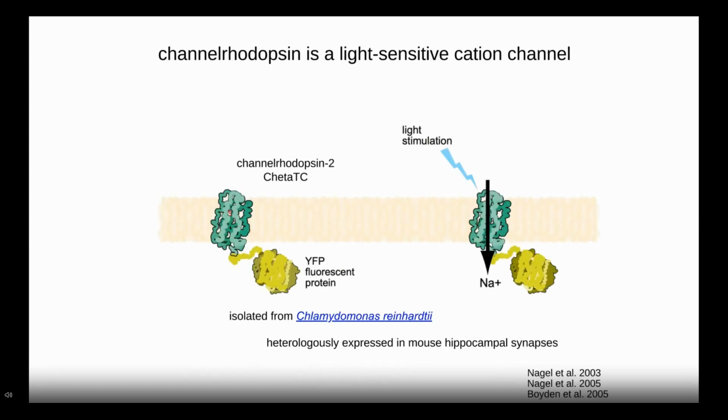The way that Shigeki and others developed this, starting over 10 years ago, was initially using a system that they named flash and freeze. The freeze obviously comes from high pressure freezing. The flash comes from the fact that you're using light to stimulate the cells. In this system, they use a molecule that will be familiar to any of the neuroscientists here, channelrhodopsin. At the time this was developed, channelrhodopsin was a hot new technology in neuroscience, which is widely used because by expressing it in neurons, you can make excitable cells like neurons excitable with light.